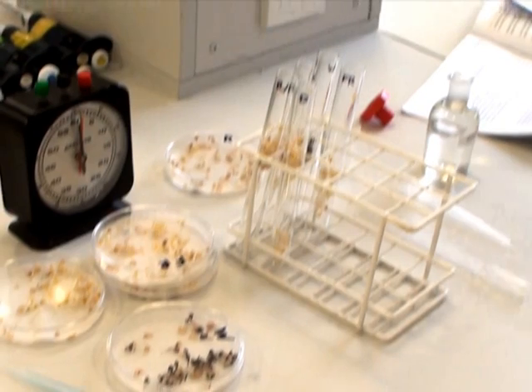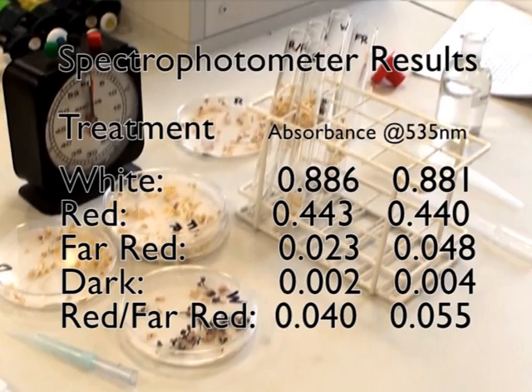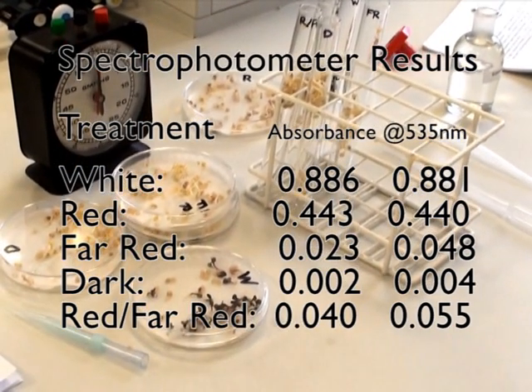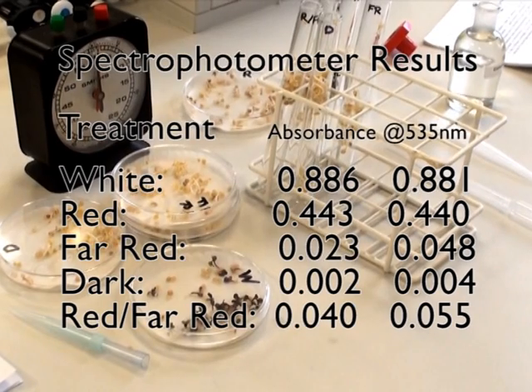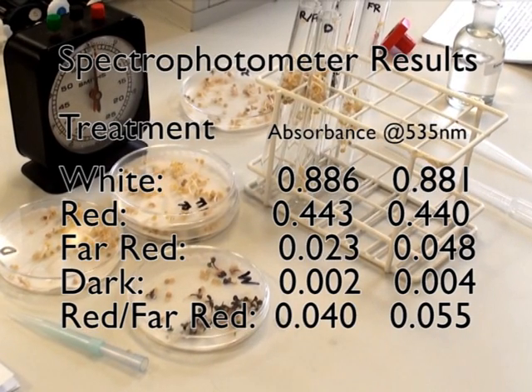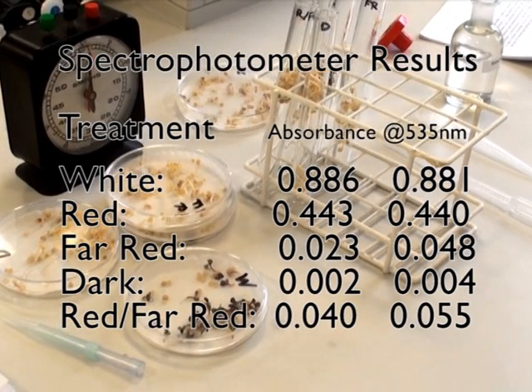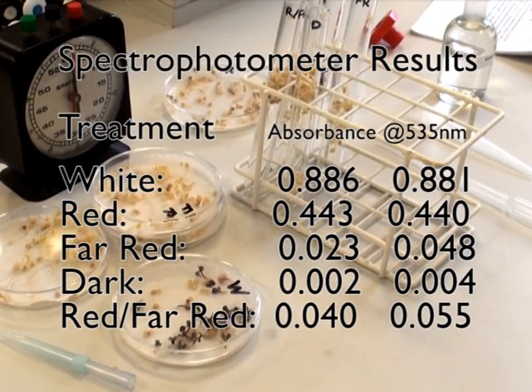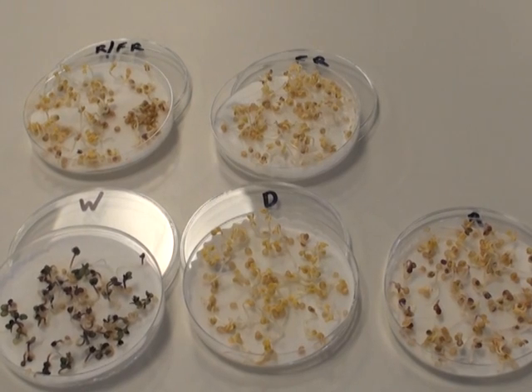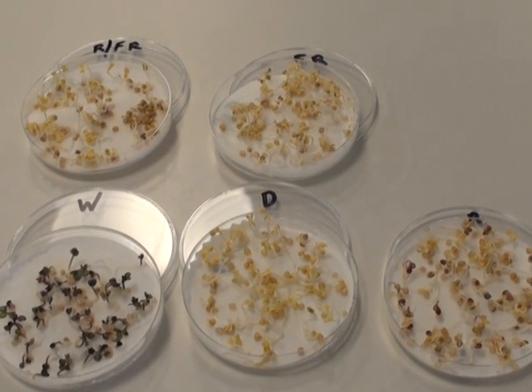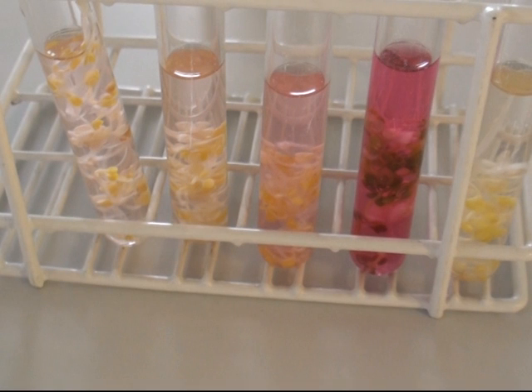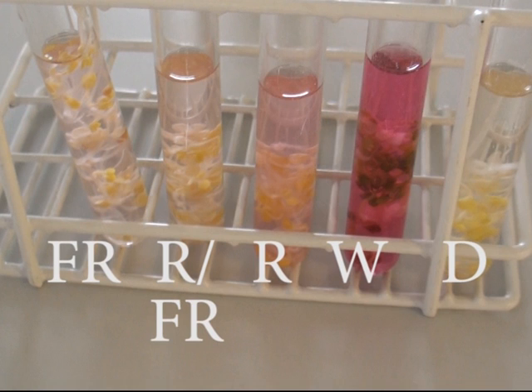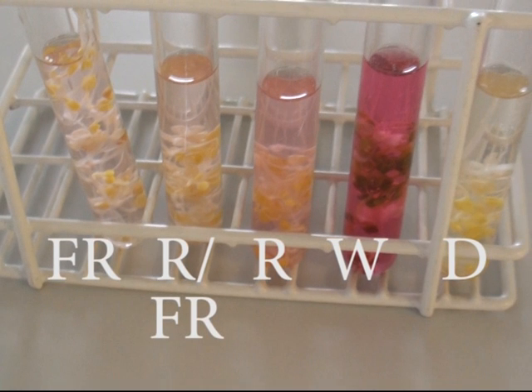These experiments are repeated two times for each one of the treatments with different lights and you can see that the white light gives the darkest red pigment with highest absorbance value. Whereas the red gives about half that and the dark and the red followed by far red treatments give very little production of the anthocyanin pigments. If we look at those, those results fit very well with what we see from the tubes themselves.